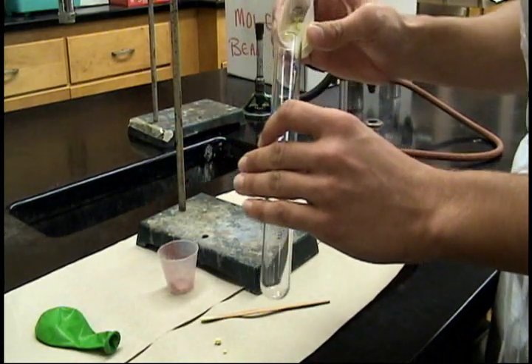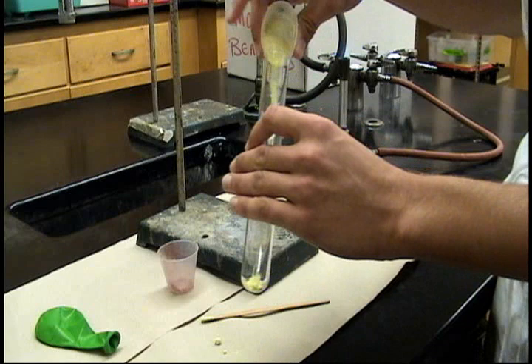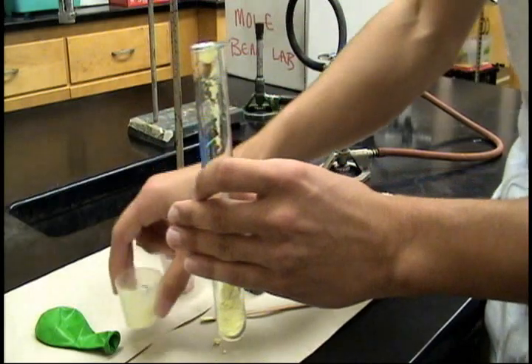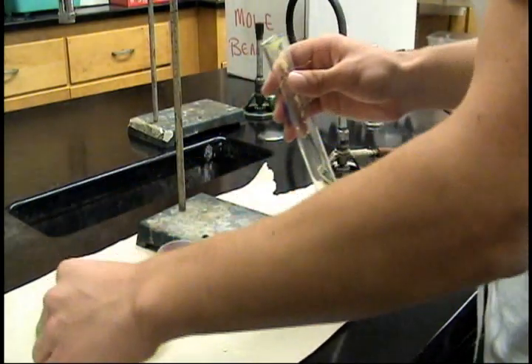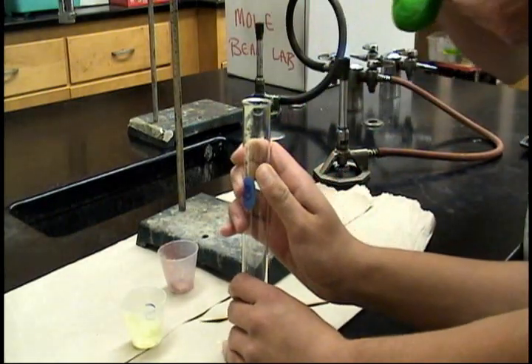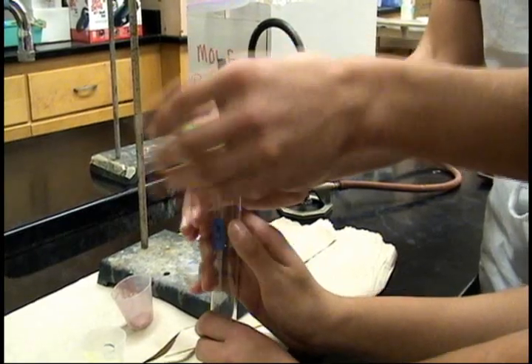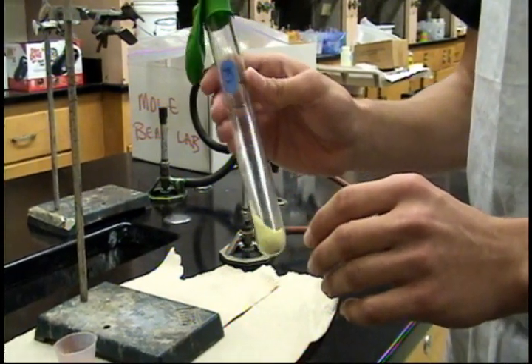Now carefully place the mixture of copper and sulfur into your test tube, and then cover the top with a balloon. This will keep gases from escaping and lets you do the mass conservation tests too. Now I'm going to take this over and weigh it to get a before weight.